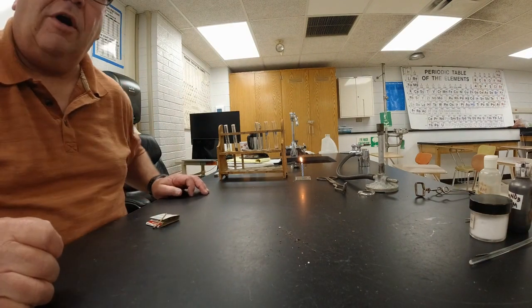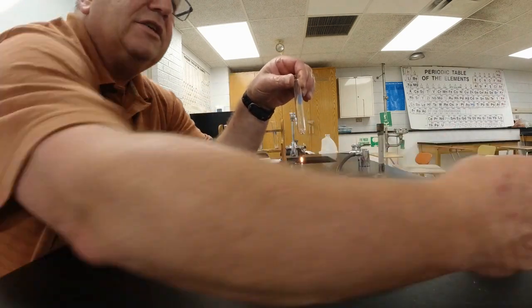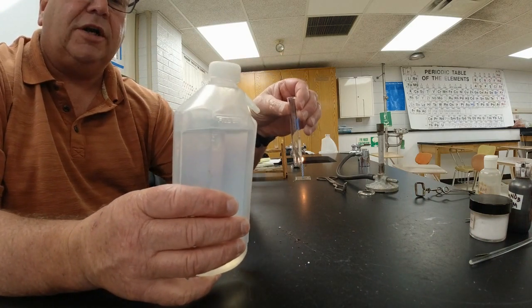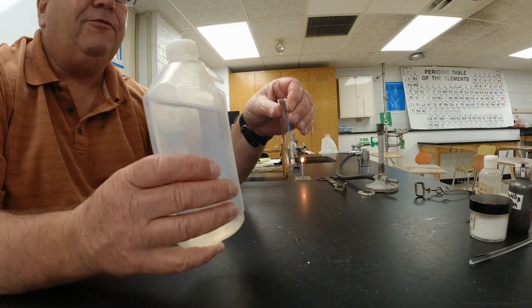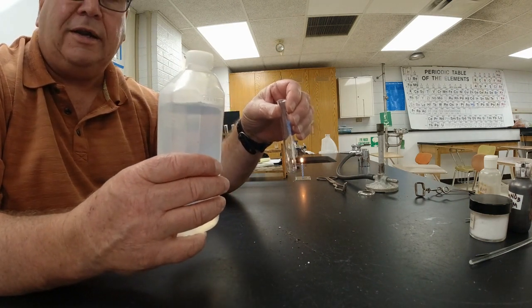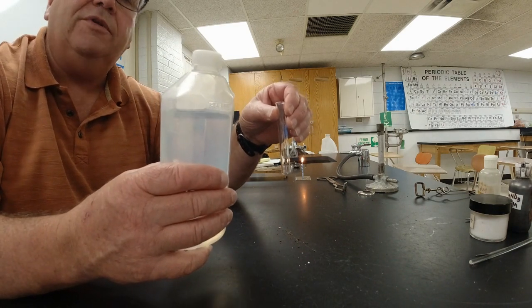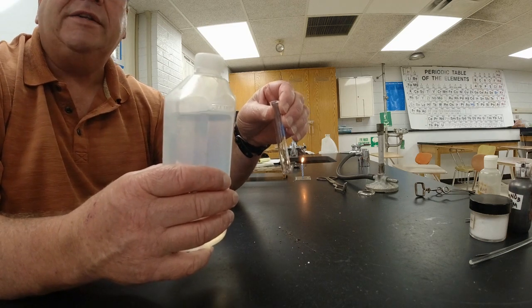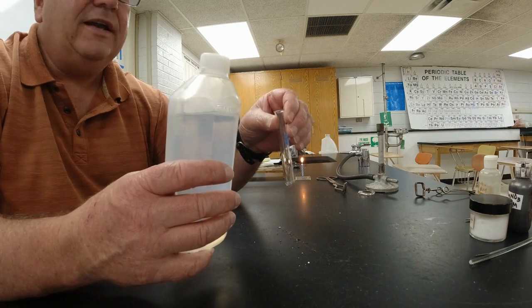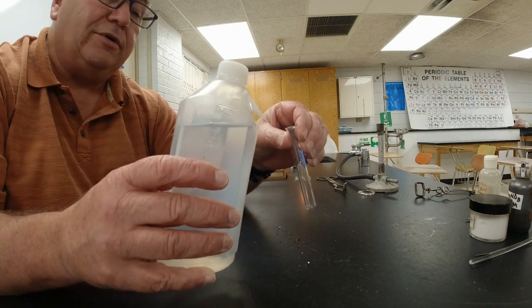In step number 4, we're going to take a test tube, and it says that we're going to put about an inch of water into it. Now, typically in science, we use distilled water. That means there's no chemicals left in it. If we were to take water from, for example, Norland Park, there's a whole lot of chlorine in it, and you would get a reaction a lot of times with the chlorine that's in there. The chlorine is there to help keep the water safe. The chlorine kills bacteria, kills any germs that would be in the water, but you keep it down at a low enough level that it's safe to drink and it won't hurt you.